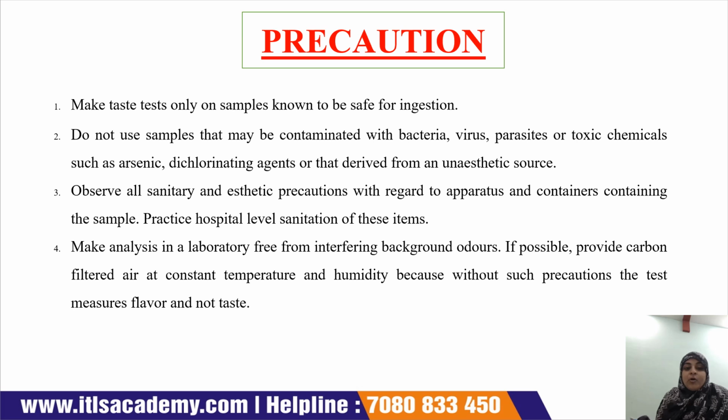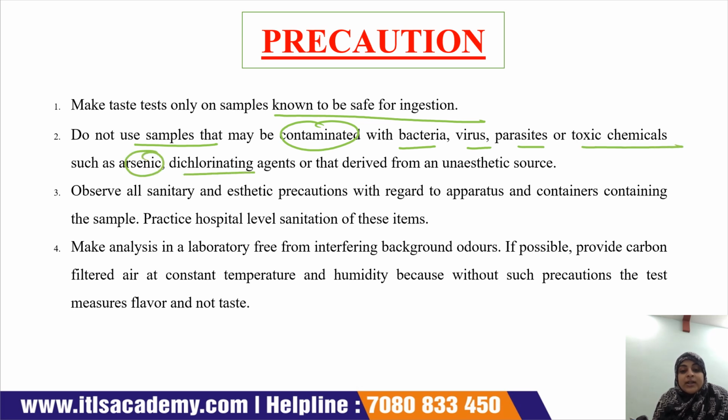Precaution: make a taste test only on samples known to be safe for ingestion. Do not use samples that may be contaminated by bacteria, viruses, parasites, or toxic chemicals like arsenic, or a dechlorinating agent, or that are derived from an aesthetically unacceptable source.